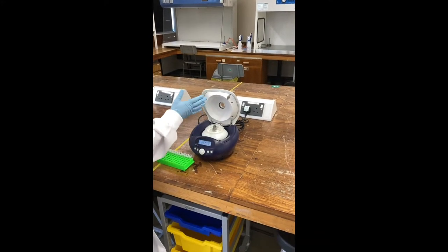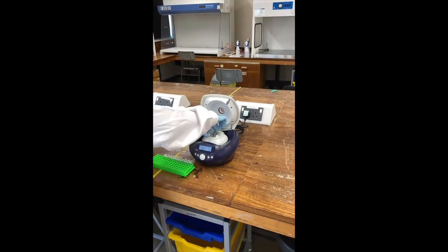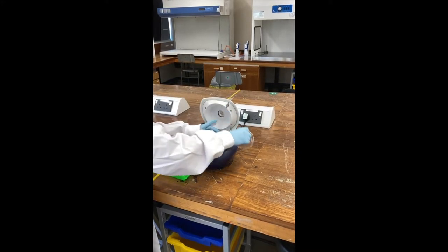So the first thing you want to do is open up the centrifuge. There's a little lid inside it like that. If you pull the top of that, you just release it and you can take it off.